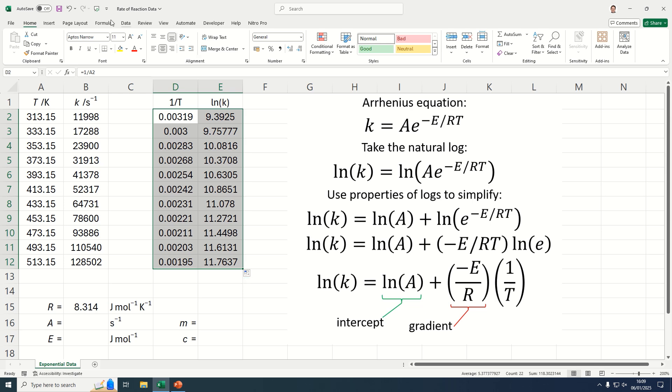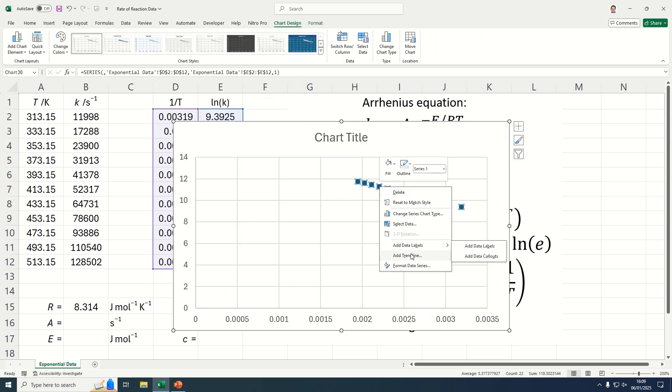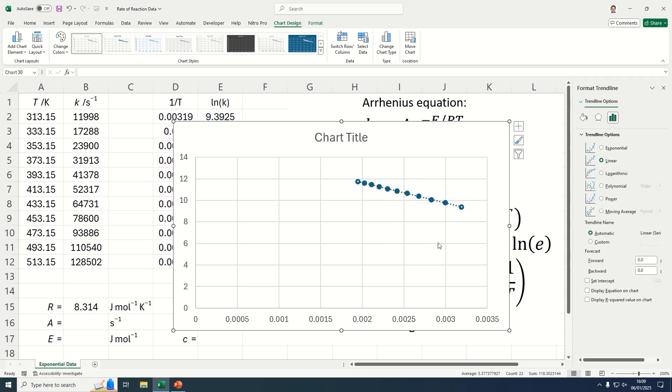And if we just do a quick check, we can insert an XY graph and indeed we see that we get a linear relationship between the two axes.